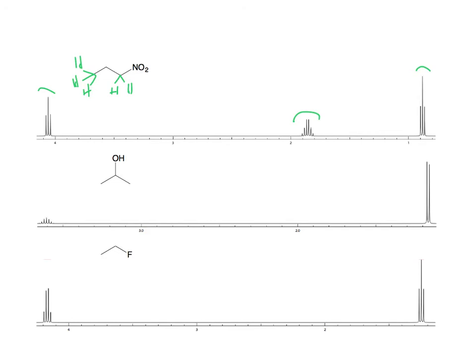And so then the next one is just isopropanol, right? So here, it's kind of small though, so this would be a septet. But it's really hard to see the smallest outside peaks there. Maybe I was going to do this whole Pople notation on this, but so this one, I think they call this an AX6 because they have 2 spins far apart.